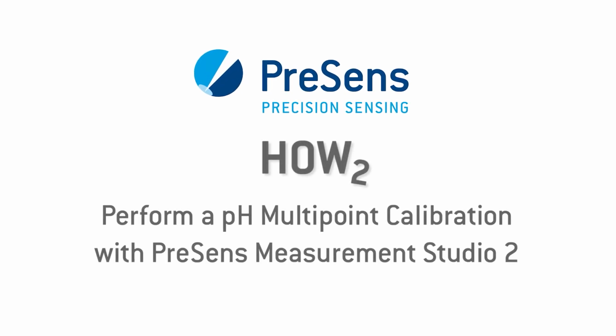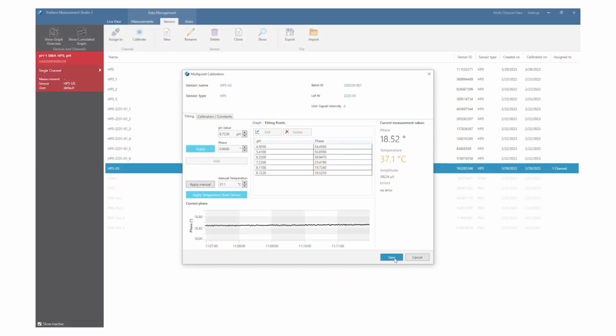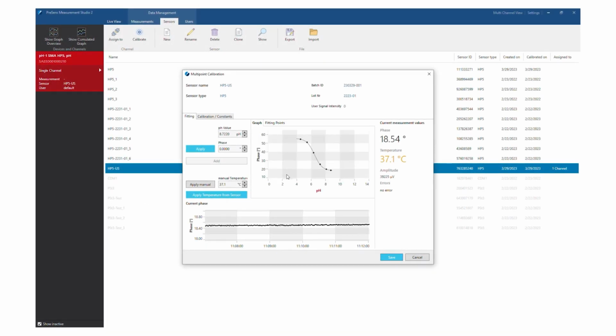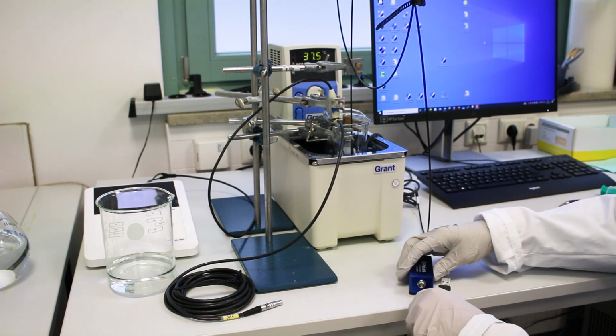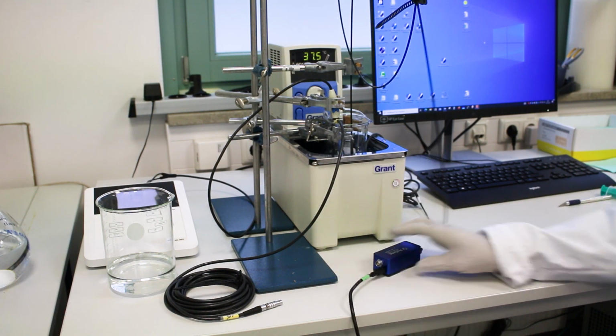In this video we show how to perform a pH multipoint calibration with the PreSens Measurement Studio 2 software and apply your calibration data to future measurements. Connect your pH transmitter to the PC or laptop and start the PreSens Measurement Studio 2 software.